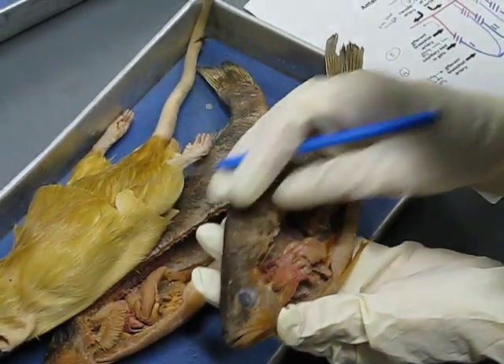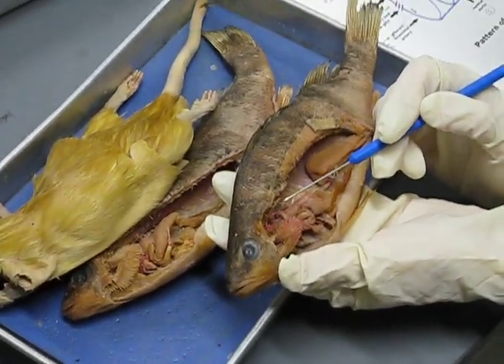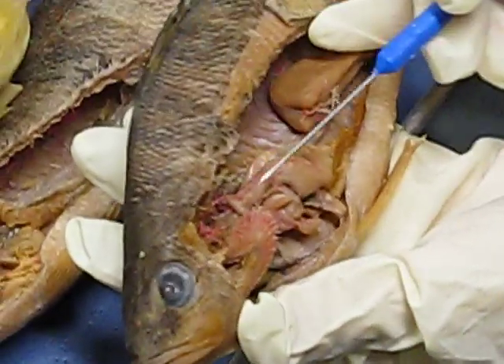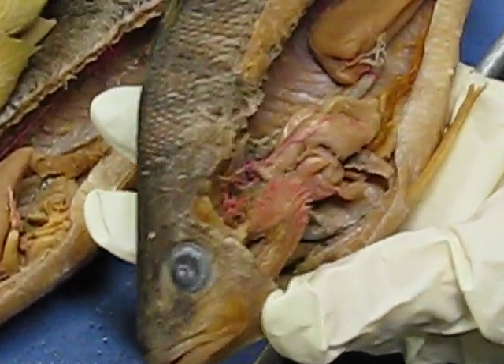Circulation. I forgot to tell you today — the ones I wanted you to see around the head were the efferent branchial arteries. Like I said, the third and fourth are fused. Here's one, two, three, and four. Nice and clean, clear.